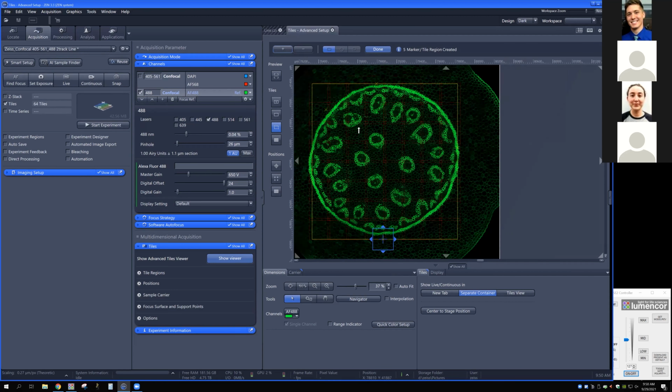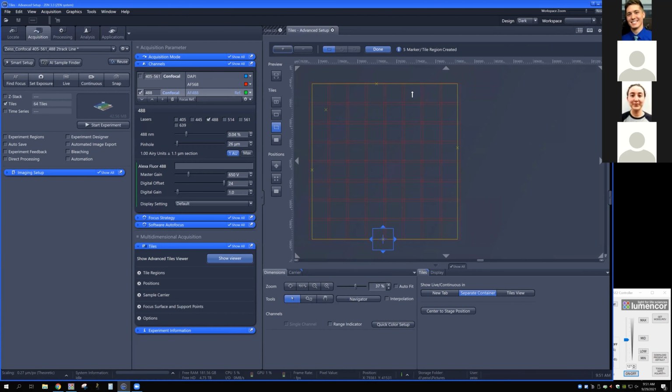And so you are probably not going to be doing this in an overview like this, but what you're, oops, well, I just lost my overview. But what you're more likely to do is, I should have clicked done and then clicked the object and then deleted that. I don't think I can undo any of that. Oh, maybe I can. Nope. Bummer. Let's do that again, shall we?